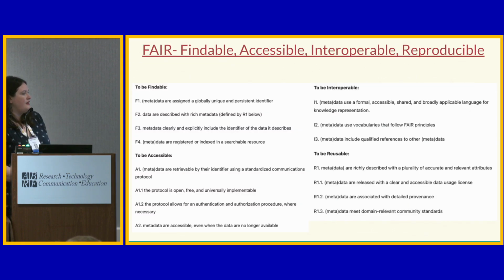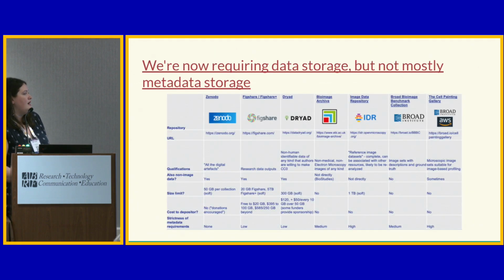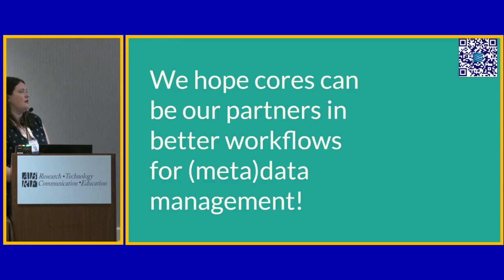And we hope, and I know there's a lot of movements, certainly within BINA and with ABRF, BINA being Bioimaging North America, which is a group I'm part of, around making more data findable, accessible, interoperable, and reproducible. But there's still a lot of work to do because even all of the places where you can put data, most of them don't have very large metadata requirements. And I think the core facility folks are particularly well positioned to be partners in how we solve this problem because you guys see what users are actually capable of doing, what users are actually doing, and how we can help. So we want cores to be our partners in these efforts.